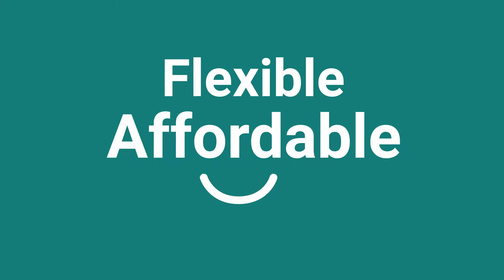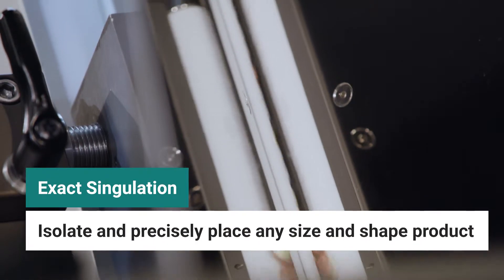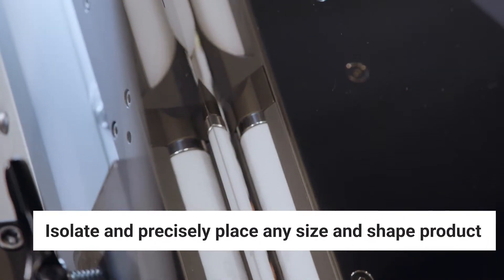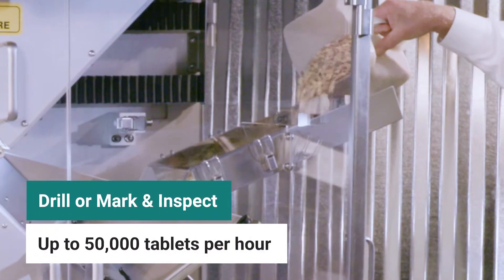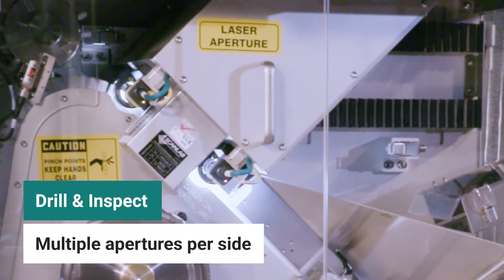This single lane system accommodates capsules, tablets, and LCTs of any shape and size, and can drill or mark and inspect up to 50,000 products per hour, utilizing two 80-watt CO2 fired, air-cooled lasers.